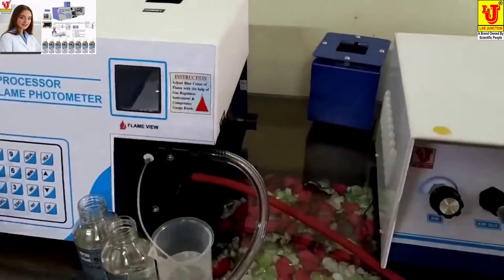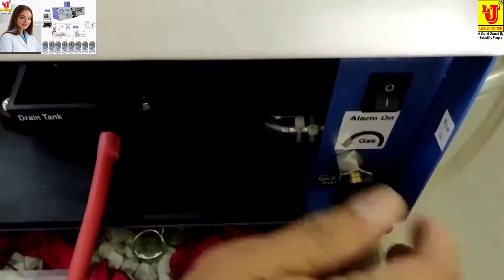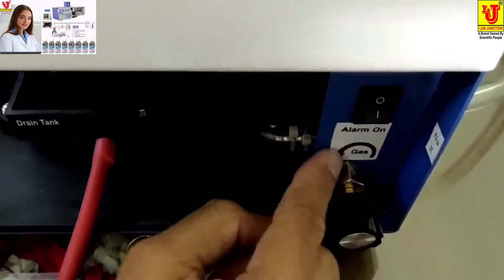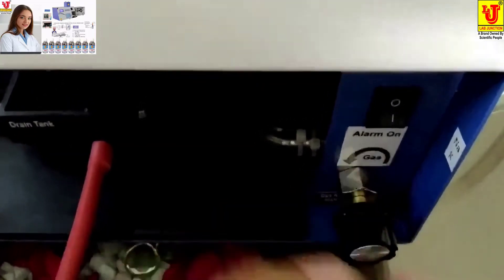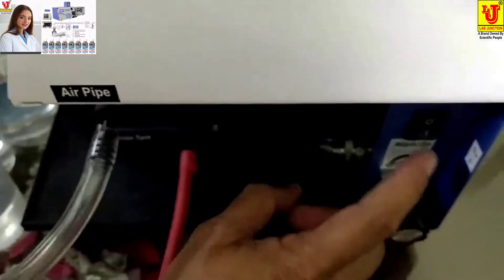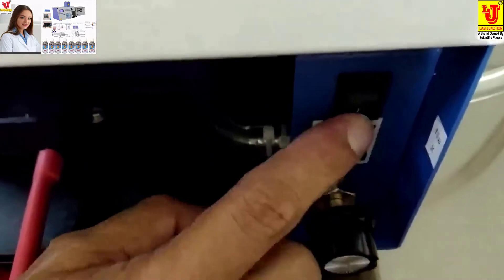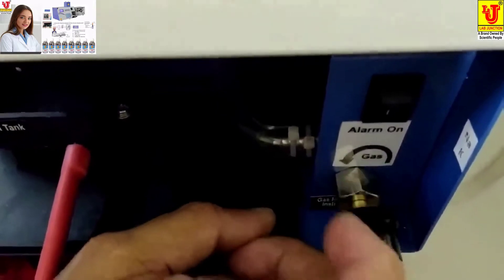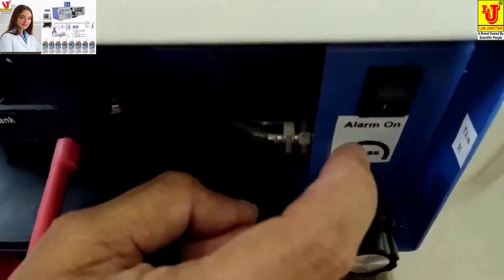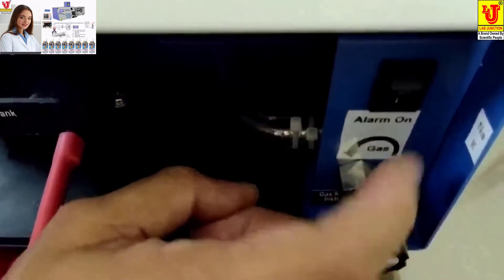Now, how to light the flame of the flame photometer. This is the gas regulator — first of all you minimize it. This is the minimize mark, and this is maximum. You have to minimize it. This is the alarm indication for gas — if gas is not present it will indicate. You can switch on this alarm, then switch on the gas.